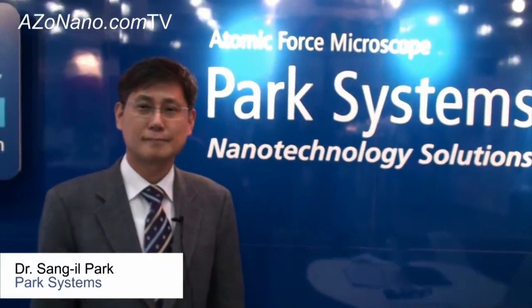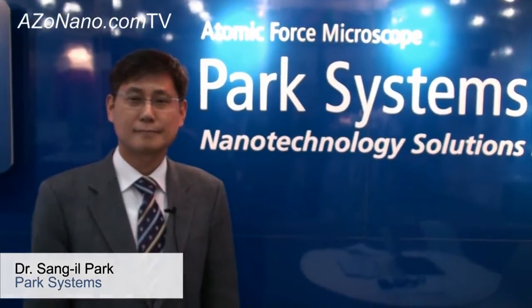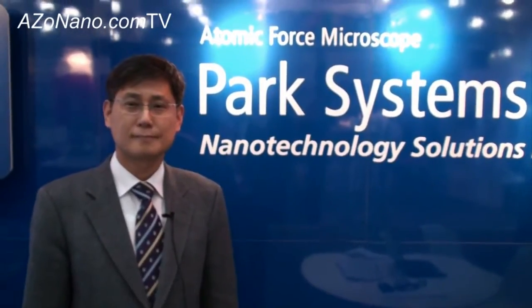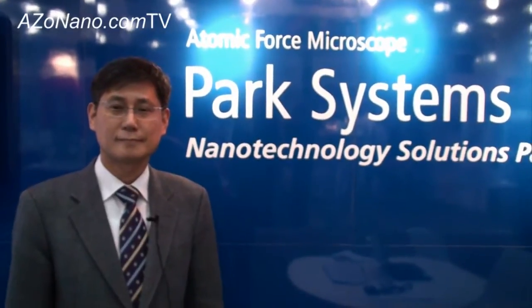This is Cameron Chai from azonano.com and I'm bringing you another episode of azonano.com TV. Today I'm talking to Dr. Sang-il Park from Park Systems and he's going to show us the XZ100 AFM system.